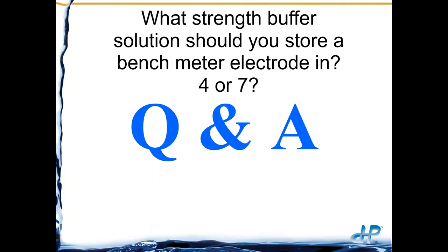Another question here is, what strength buffer solution should you store a bench meter electrode in? Again, 7 is neutral, but 4 is just as fine. A KCl storage solution is ideal. That's the most preferable. But if you need to use a 4, you can use a 4. That's what we use commonly.